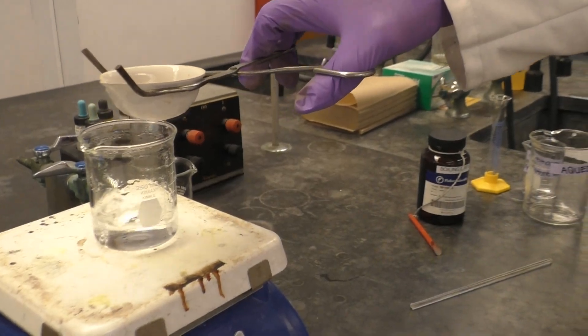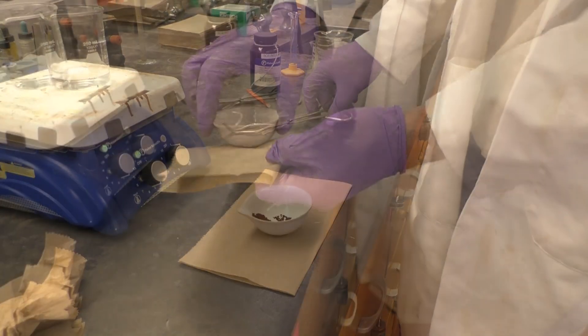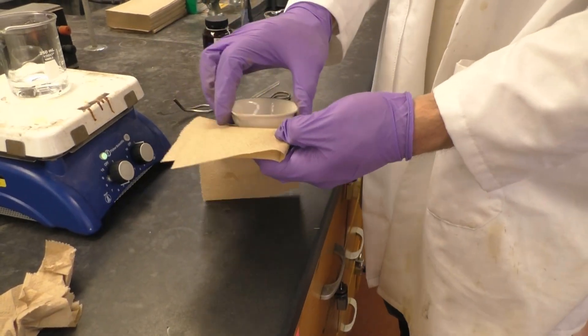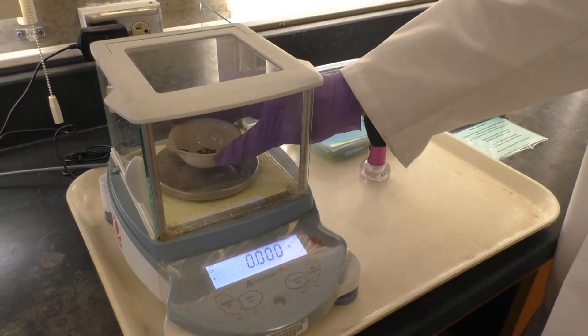Once your final copper product is completely dry, just take your dish off the steam bath, allow it to cool, wipe off all the water on the bottom, and then obtain its mass.